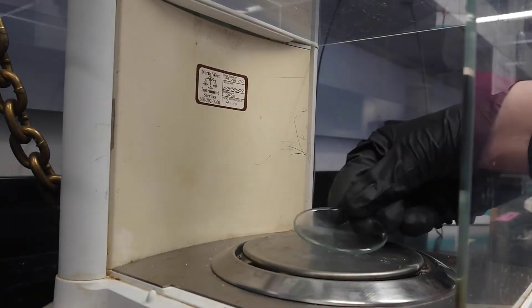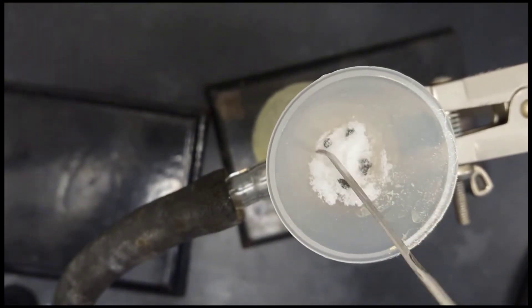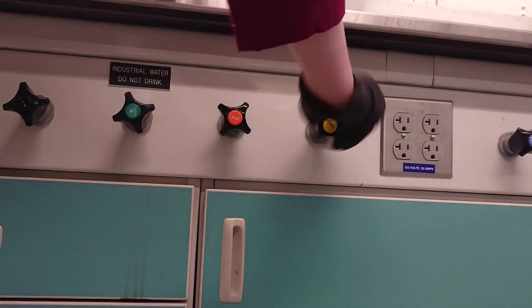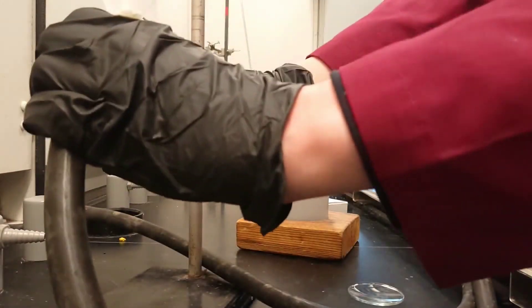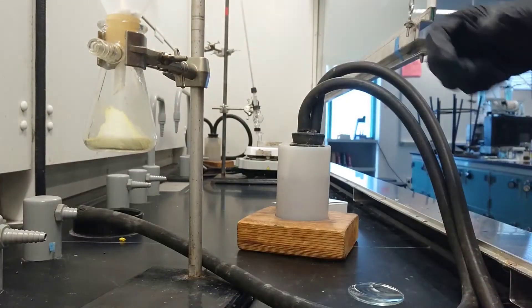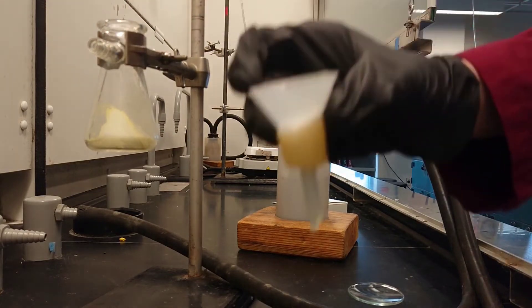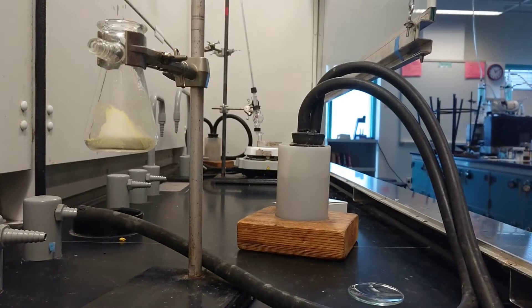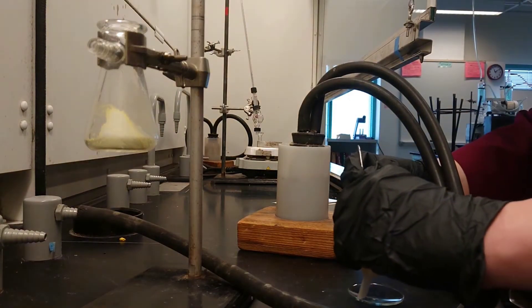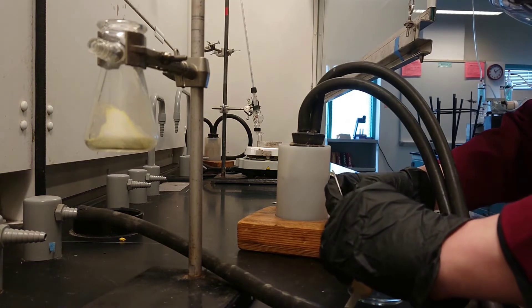Record the mass of a watch glass that will be used to weigh the crystals. When the crystals are dry, they are ready to collect. Turn off the vacuum. Transfer the crystals to the watch glass and remove the boiling chips.